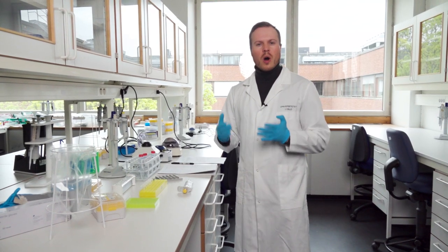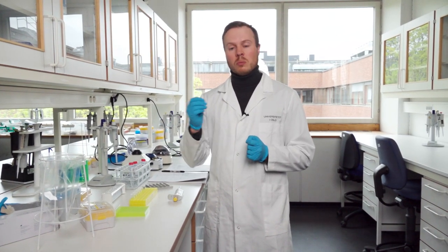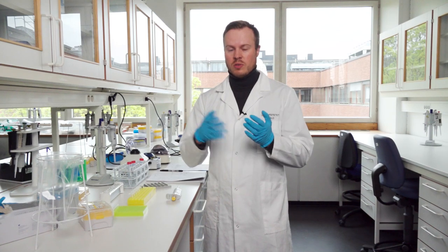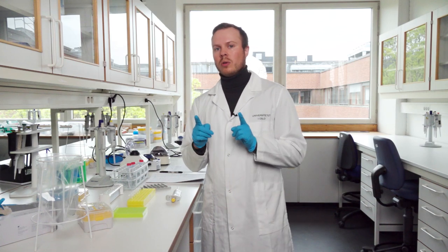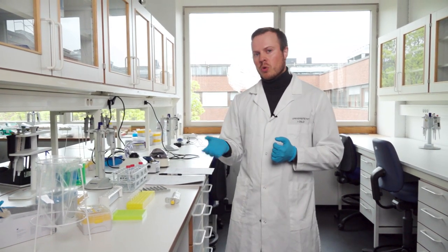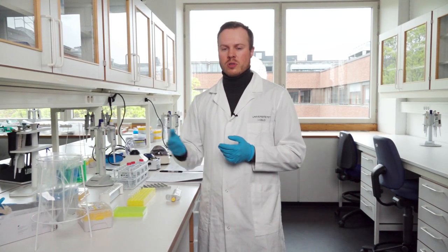Let me explain why we do the bead cleaning. When we add the DNA to the magnetic beads, the longer fragments of the PCR products bind to the beads due to magnetic force. The shorter fragments, normally called primer dimers, don't bind as well. So it's a way to select between different lengths of PCR products to keep the lengths we want. It also involves washing steps with ethanol and an elution step.